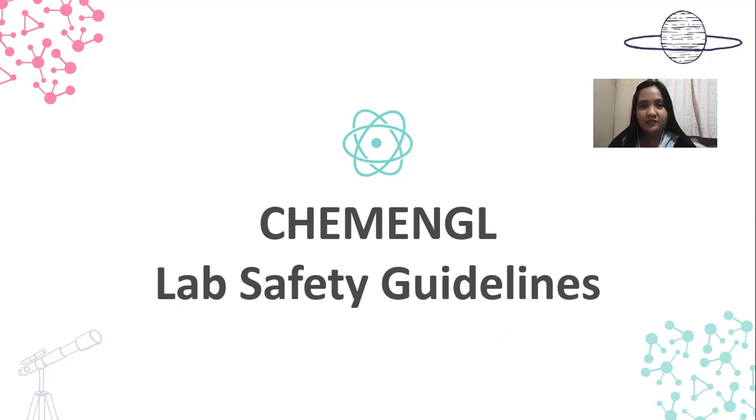So it says here from the title, Lab Safety Guidelines. This will talk about basic safety guidelines inside the laboratory. I tried to isolate it to the chemistry laboratory, but some of the concepts or guidelines we'll see here can also be applicable to your laboratory classes in the future.